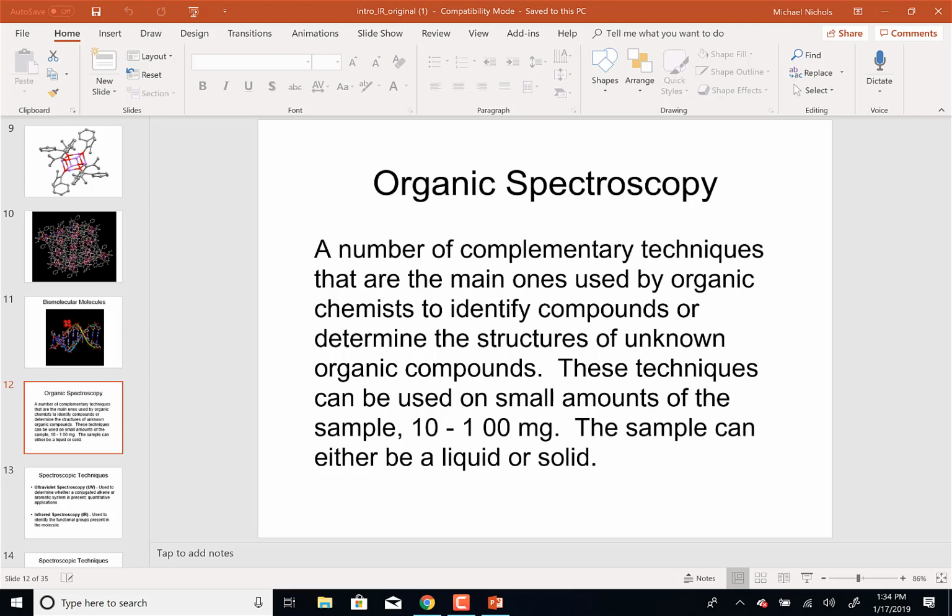Sometimes this can be in the nanogram region, which we'll talk about with mass spec later. When you have a drug test taken, they're using mass spec and they're looking for metabolites in like your urine, and those metabolites are at super low concentrations. So the more stuff we have in general, the better, but if we have really tiny amounts, we could still do it with certain techniques.